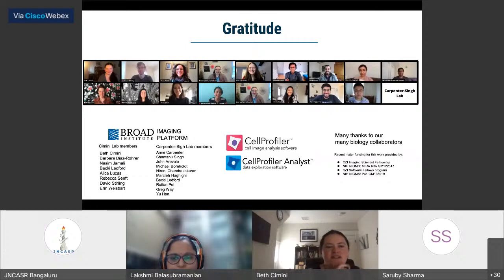Yeah, moving the profiling approach into tissue is absolutely something that we've played around with. The biggest challenge typically is whether you can get accurate cell boundaries within a tissue. It's much harder. But there's absolutely no reason that the same approach can't work there as well. It's just because it's harder to get accurate boundaries that it's not something people have tried very much. But in theory, it's not particular to fluorescence, not particular to cultured cells. Getting as many measurements as possible is the real magic to the trick.